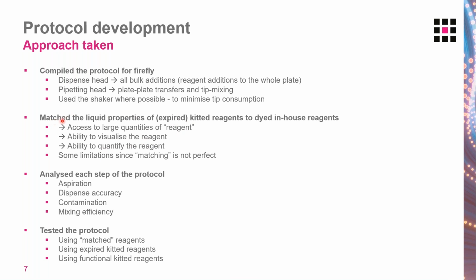So what we do is we match the liquid properties of our kitted reagents to dyed in-house reagents. And in this way, this gives us access to large quantities of reagent to really look in detail at these dispensers. We are actually able to see the reagent, which has huge advantages. And also, if we want to, we can quantify the dispense because we've got that dye in the reagent.